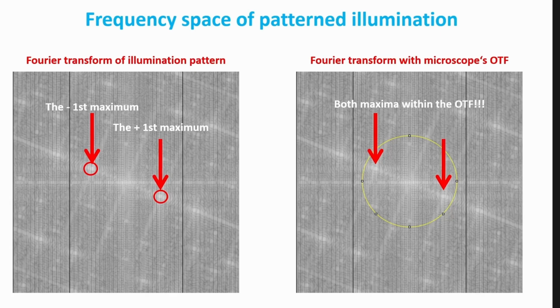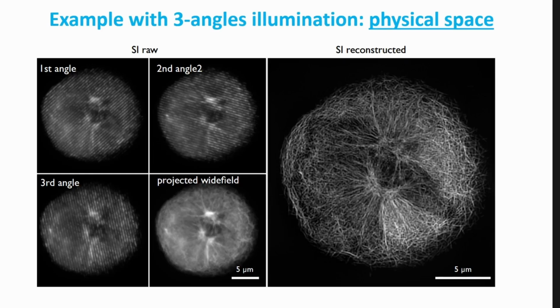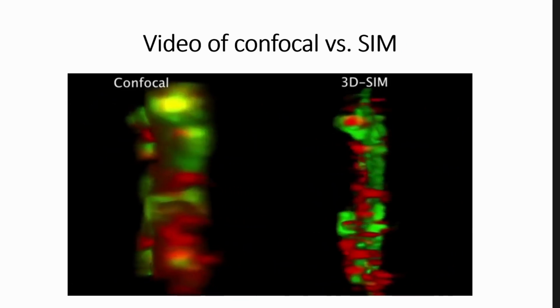It's very, very simple. Like I said, in '94 we already had a system like this. This basically means that you didn't change the optical transfer function, but you changed the frequency spectrum of the sample. And of course, the individual images, like I said at lunchtime, are patterned. So the pattern illumination has to be shifted or rotated or both to cover the whole sample. But what you get at the end is a twice as good resolution of the image. The maximum that you gain is, like I said, twofold.